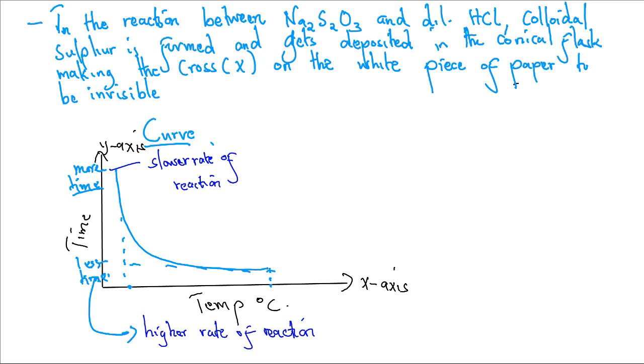Now, we have concluded from this experiment that at higher temperature there is a high rate of reaction, and at lower temperature there is a low rate of reaction. And that is all about temperature and reaction rate.